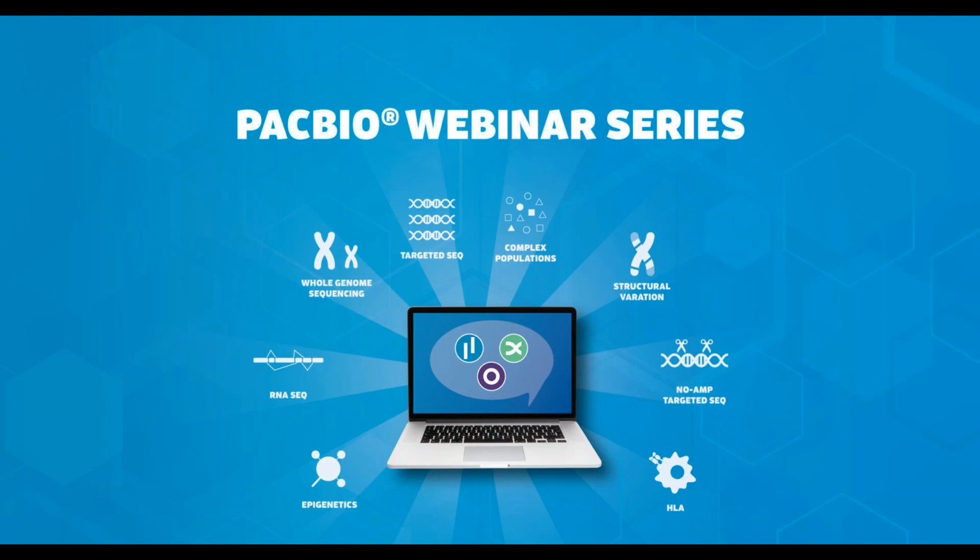And I think we're making a lot of progress on HiFi assembly, reparameterizing Falcon to not collapse repeat copies of the genome. Right now the CLR solution works really well if you can get a very aggressively size selected library for a large repeat-rich genome. But I'm optimistic that in the next 6 months or so, HiFi is going to be performing a lot better in those types of complex genomes as well.